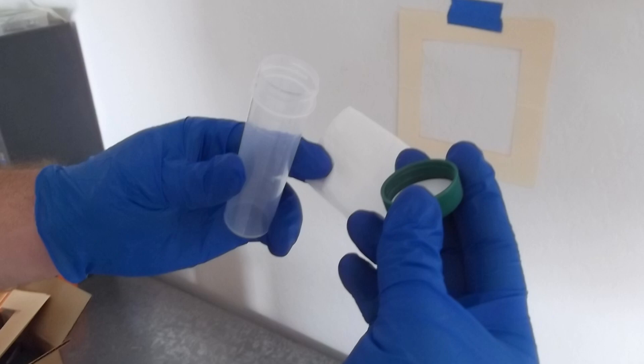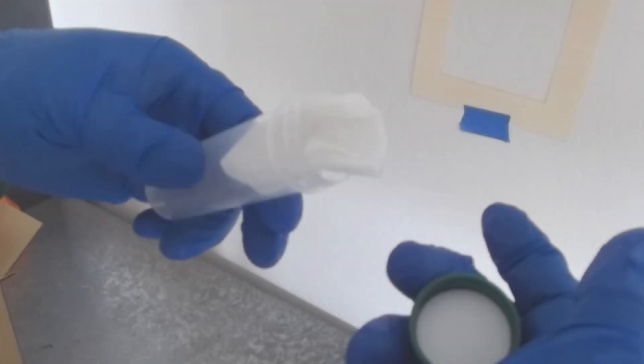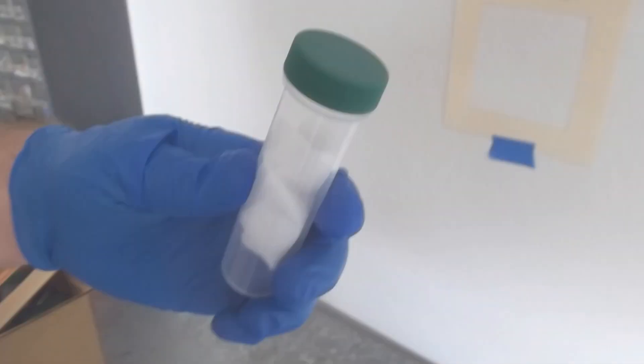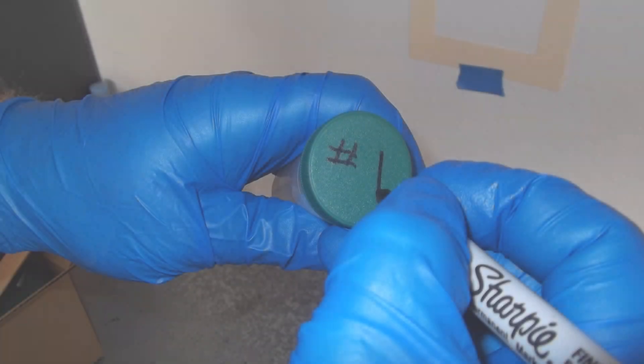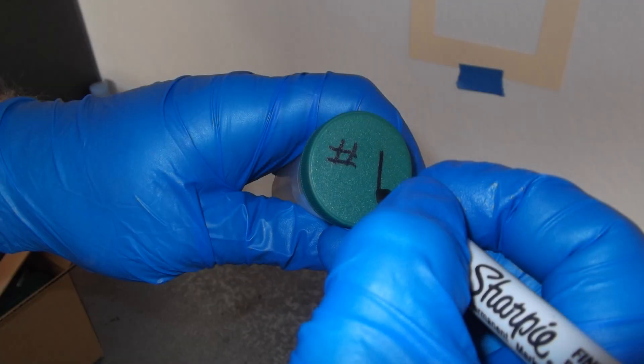Fold the wipe again and insert it into a clean 50-milliliter vial. Be sure to cap the vial securely and label it with a unique sample identification number or name.